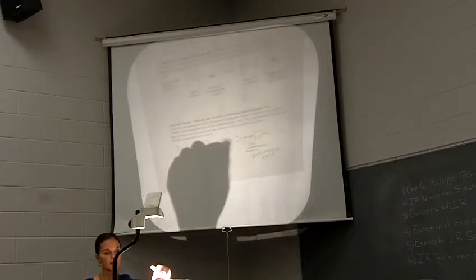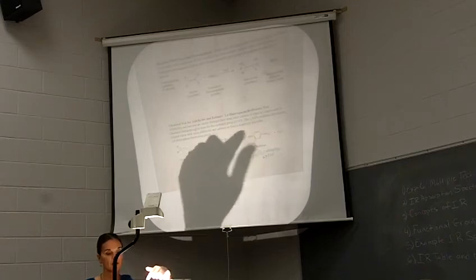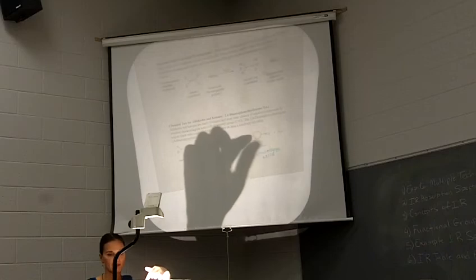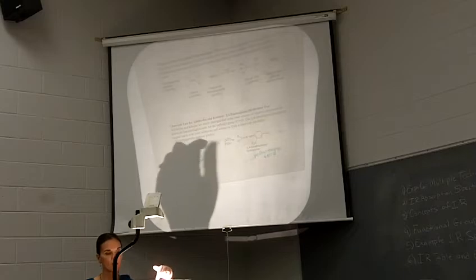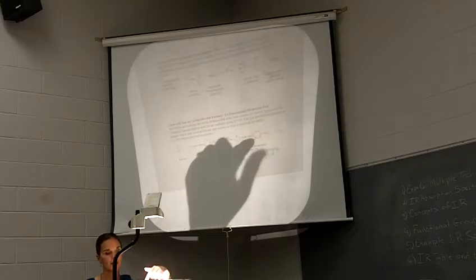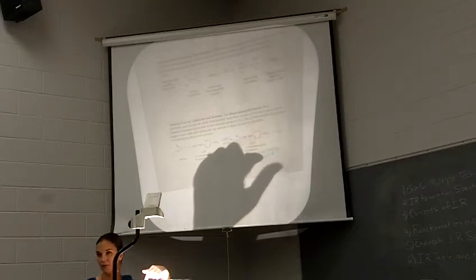When it reacts with a ketone, what we make is 2,4-dinitrophenylhydrazone. So you start with your ketone dissolved in ethanol. This is kind of an orange-yellow solution. If you get a positive test, you're going to get a yellow to orange solid that forms.